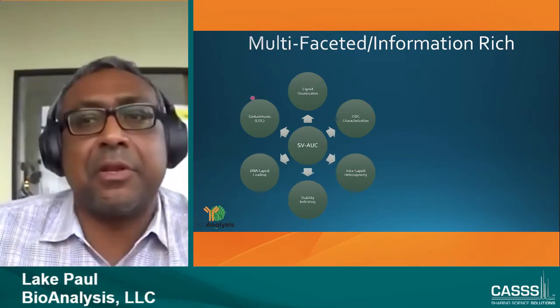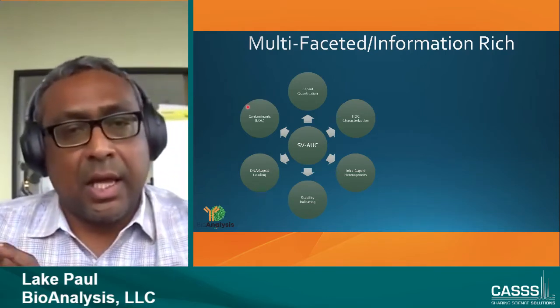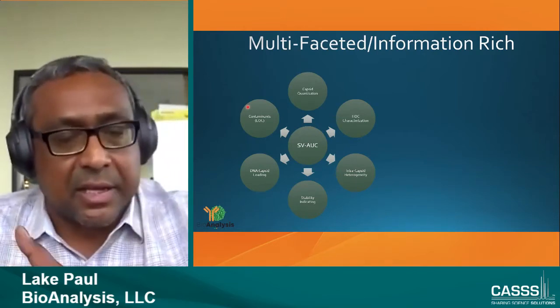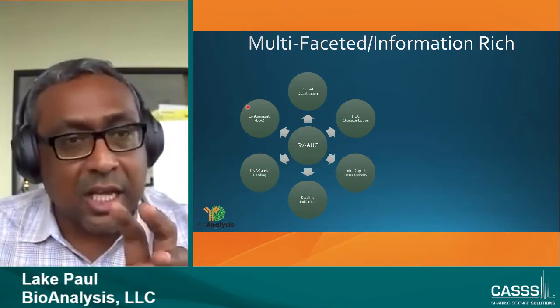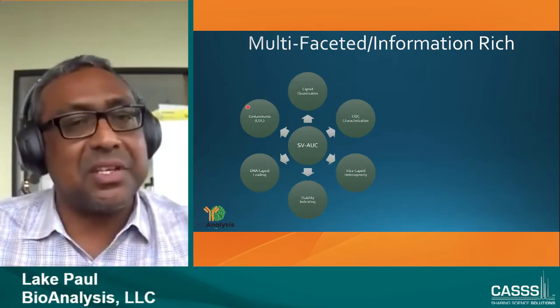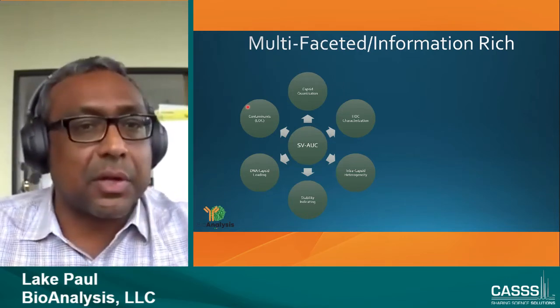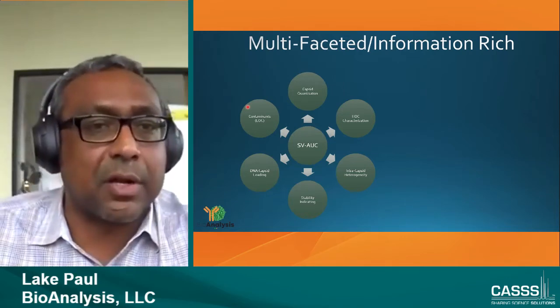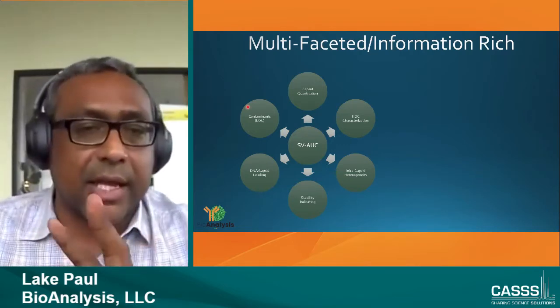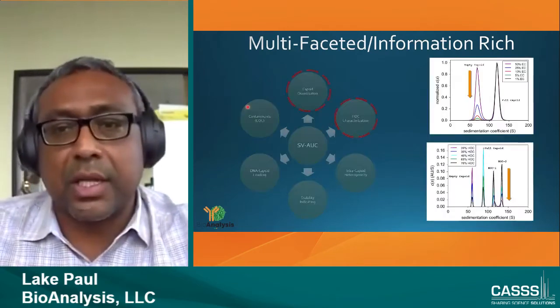Contaminants. We see a lot of contaminants in our species, whether it be a very large contaminant in terms of its size, like the empty capsid, or in certain cases, we can see small proteins in there, 26 kilodalton, that came along with your purified product. We can figure that out just by a single experiment, followed by another experiment in which you just characterize that.